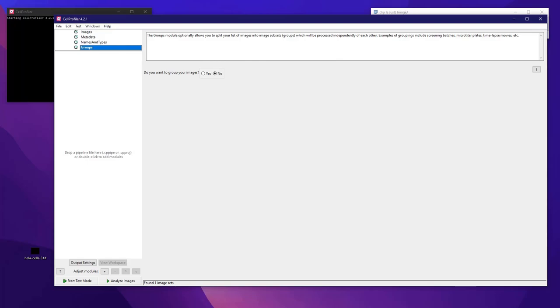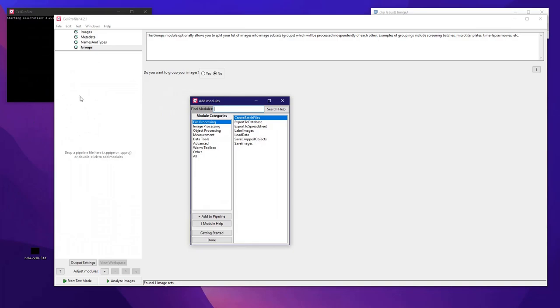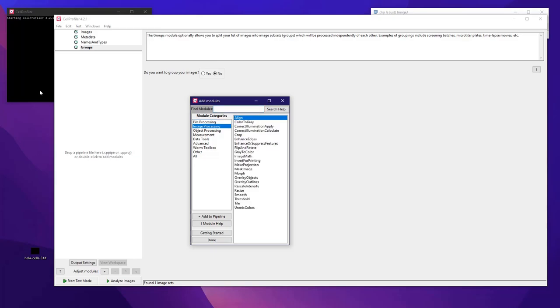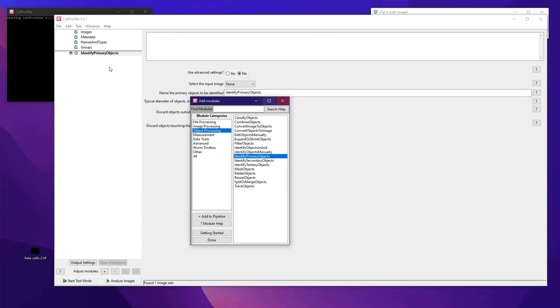To add a new module, you click on the plus button here and you will see a list of all available modules. The first thing we want to do is detect the nuclei — this is almost always the same first step whatever software you use. I will use 'Object Processing' and then 'Identify Primary Objects', because nuclei are the primary objects you want to find. I double-click on this and close the module list window.